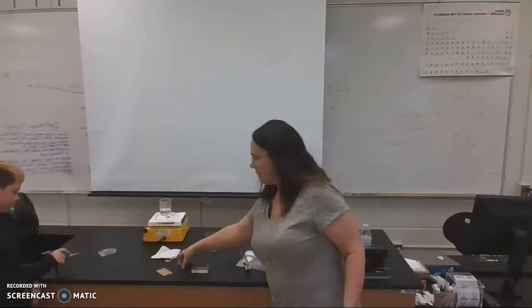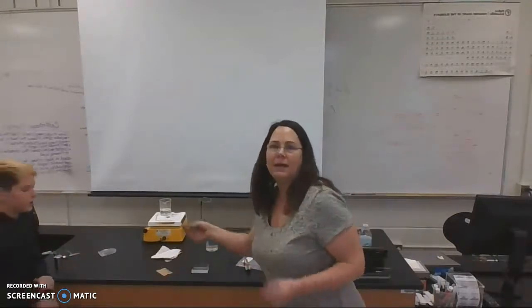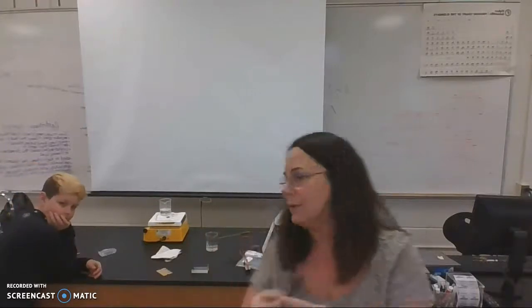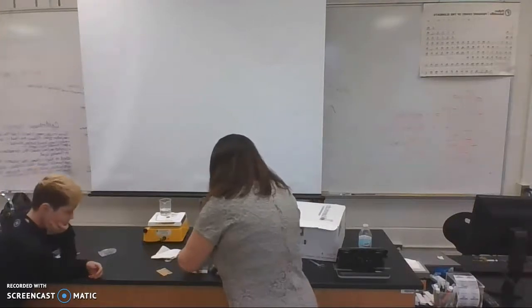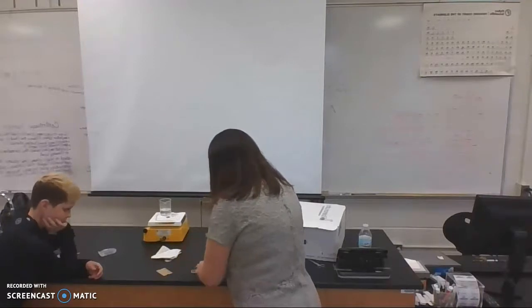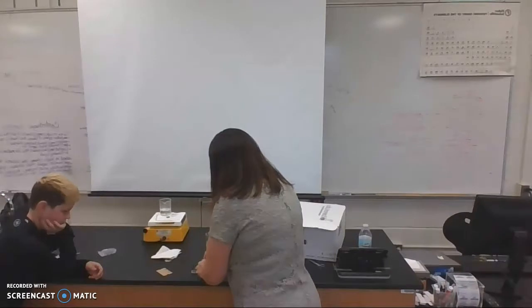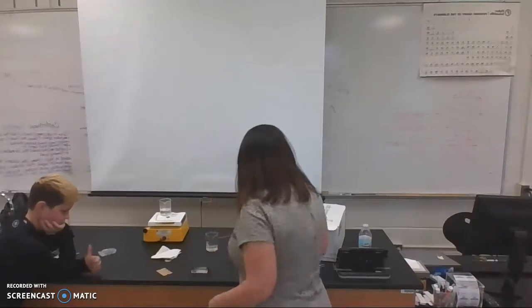I can't pick it up now to show you, but I'm taking my carbon paper and putting one end under the box and then folding the other end over top until it touches the liquid buffer. This is what we're going to clip the alligator clips to.